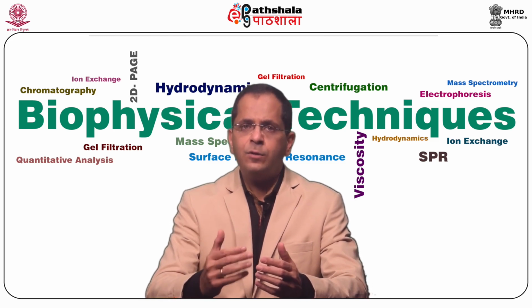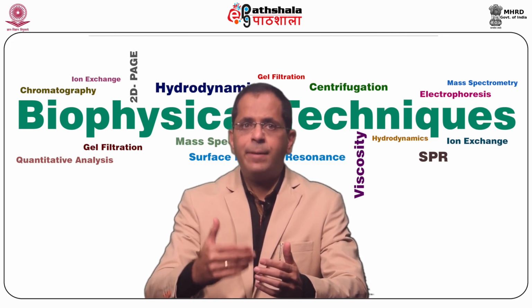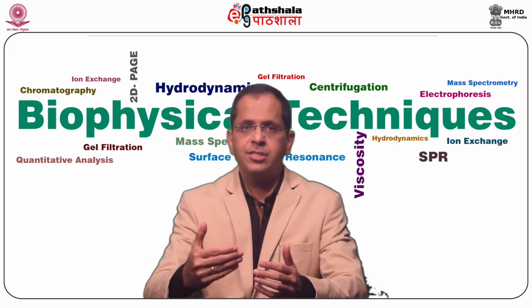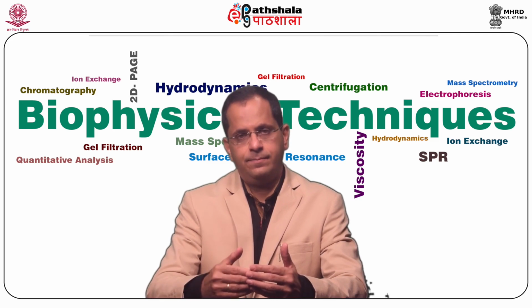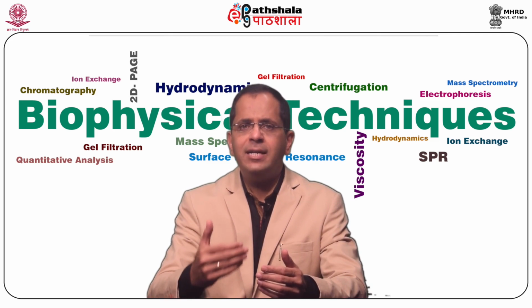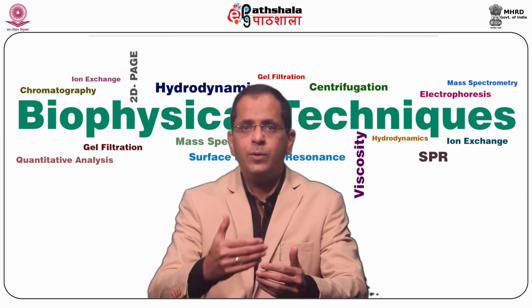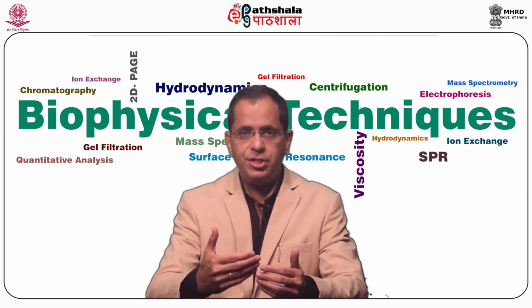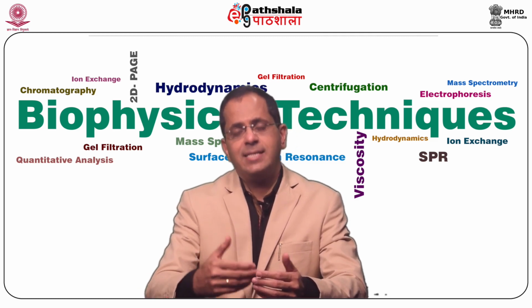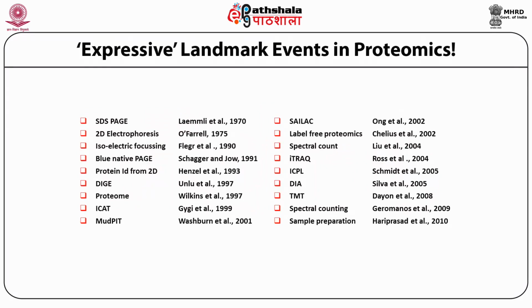The method allows for additional selectivity by monitoring the chromatographic coelution of multiple transitions for a given analyte. Although broadly used, the term multiple reaction monitoring to indicate the parallel acquisition of multiple SRM transitions might not be used in the near future. Over the last few decades, there have been a lot of expressive landmark events in proteomics.